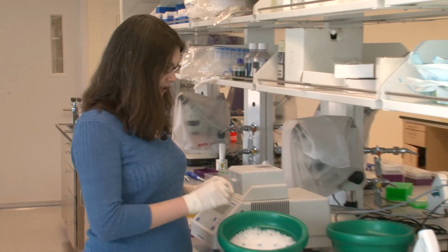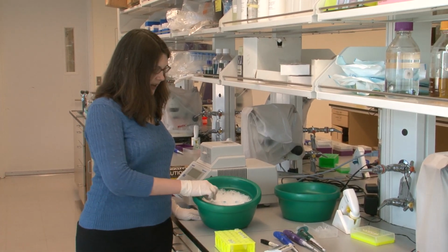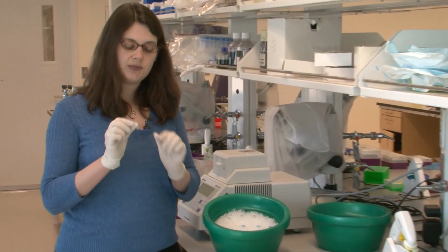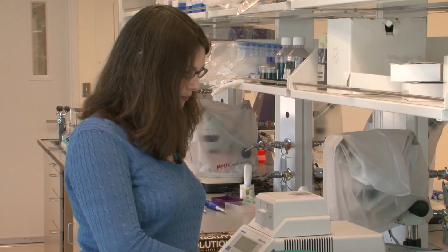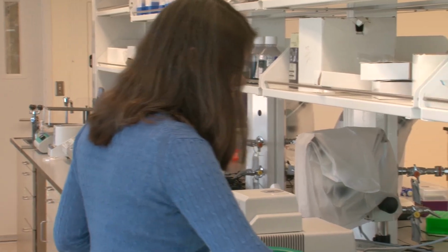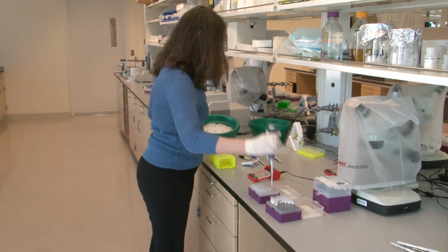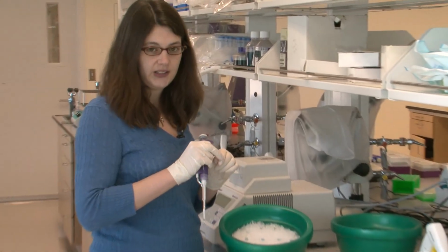The first thing that I'm going to do is take a little sample of those samples of DNA, and put them into these smaller tubes, which we'll use to copy the segment of the DNA that we're interested in. So I'll be using my pipette to transfer, for each sample, a small amount of the liquid into the small tube.